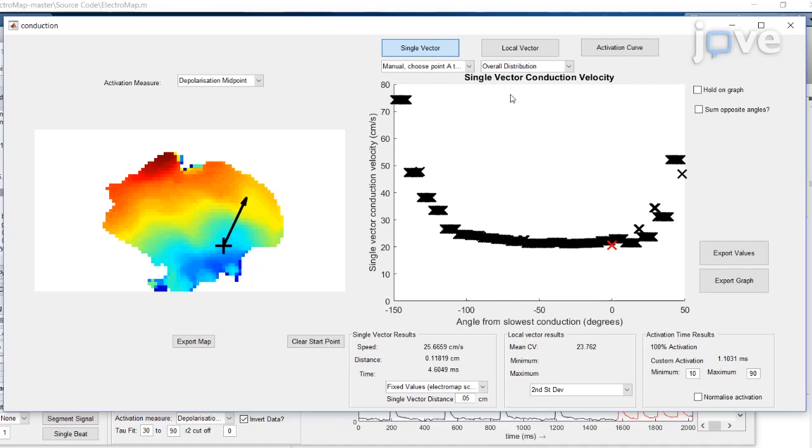This is why we have developed a novel software called ElectroMap to help researchers with their analysis. ElectroMap incorporates new and established methods to analyze cardiac mapping data which can be acquired from any species using multiple different cameras, multiple different fluorescent dyes, and different acquisition modalities including optical mapping and multi-electrode array systems.